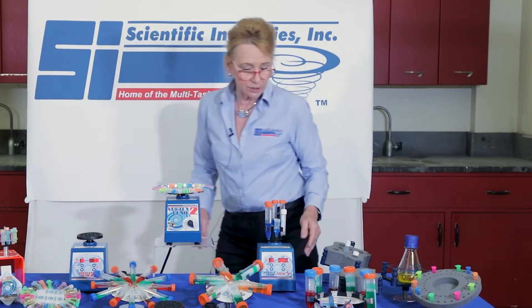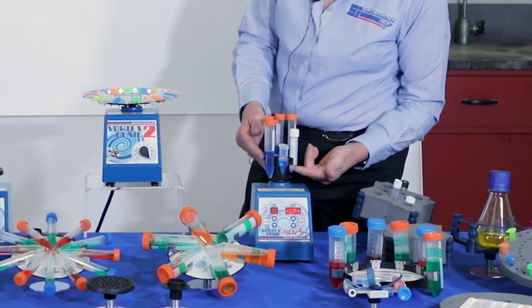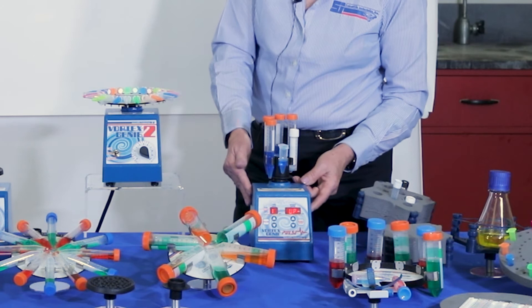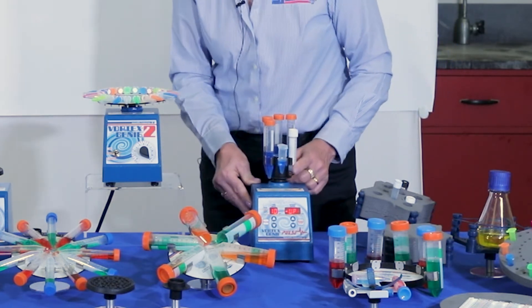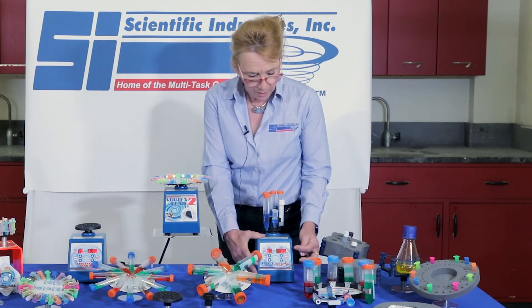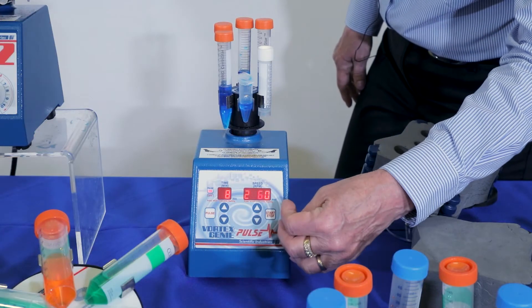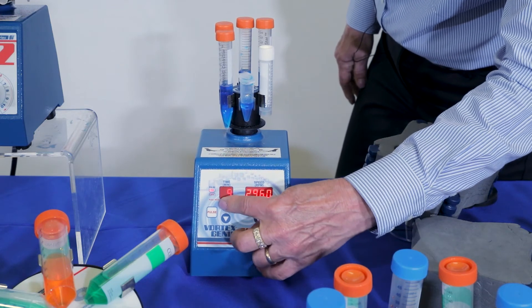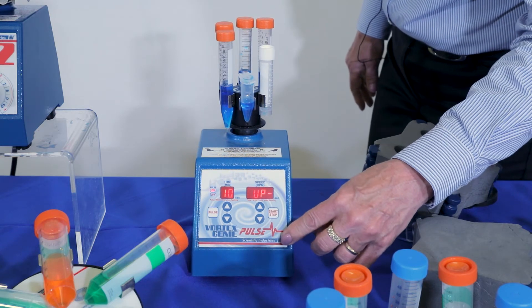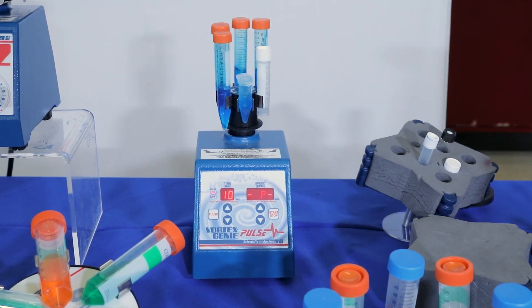What's nice with the Vortex Genie Pulse — I just put on a 15 ml high speed accessory, and you can see I'm using a 7 ml tube, a 15 ml tube, and an oddball tube as well. To program on and off, you simply press the pulse button, change up or down for the amount of time, then set your total cycle time. In this case it's going to run for 10 minutes at maximum speed. Press the start button and you can see very nice hands-free vortexing.